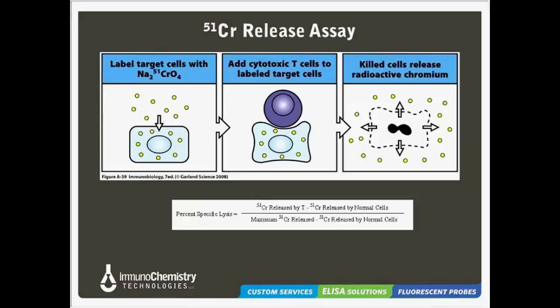While this assay can provide useful quantitative data, there are some major drawbacks regarding lab safety, the high cost of running the assays, along with the detrimental effect of radioactivity on the cell function, which may skew results. The chromium-51 release assay is also susceptible to wide variations in radioactive labeling and exhibits a relatively high level of spontaneous chromium-51 release.